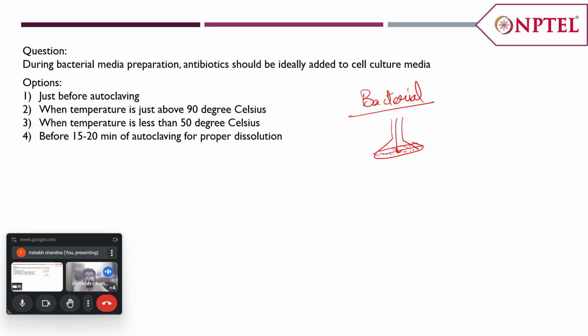In some cases we can heat it and then autoclave it again, but there is no point in doing that because when we are autoclaving, the same amount of heat is generated. So if we can directly autoclave it, then it is already fine.